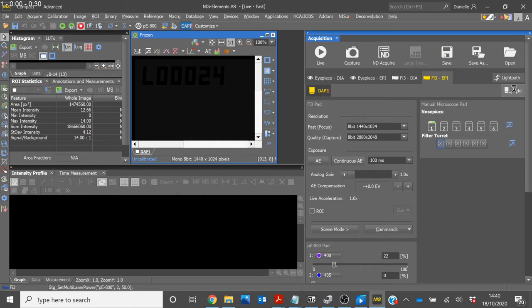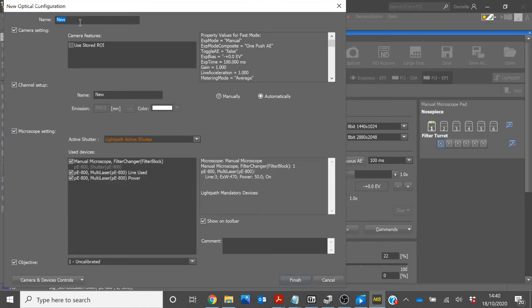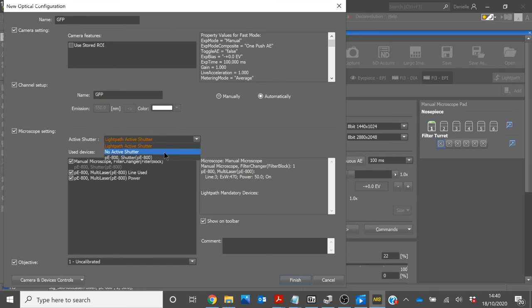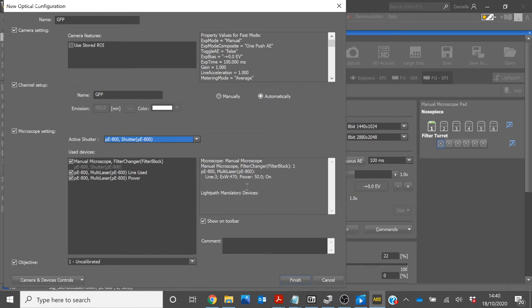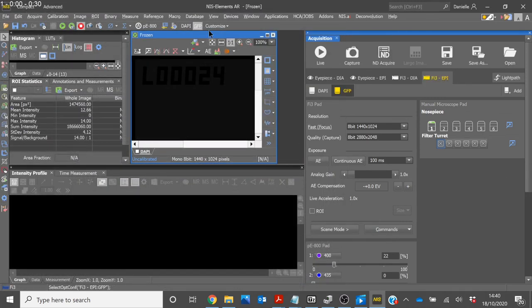Click Add. Change the name to GFP. Ensure that the active shutter is set to PE800 Shutter. And you will see here that the LED has changed to the 470 and the power has updated too. Once you are happy with these settings, select Finish. You will see that GFP now has also appeared in the toolbar.